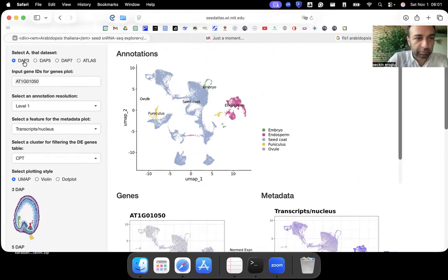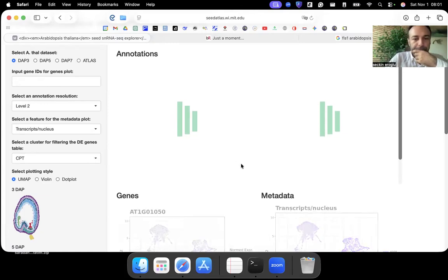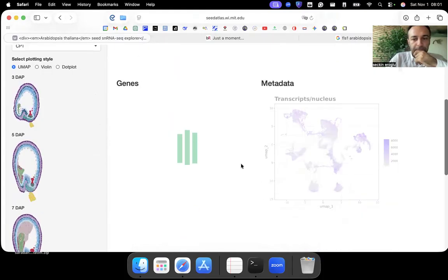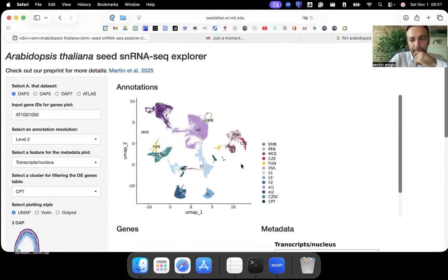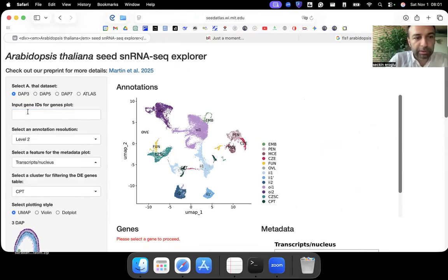Let's say we search 3 days old. Okay, and then we here write the gene of our interest, but I will first show you what each of these things mean.